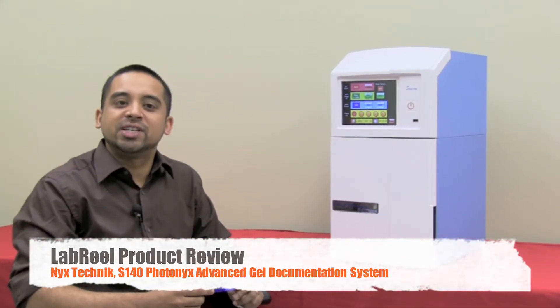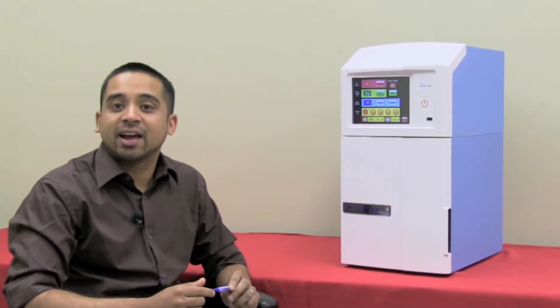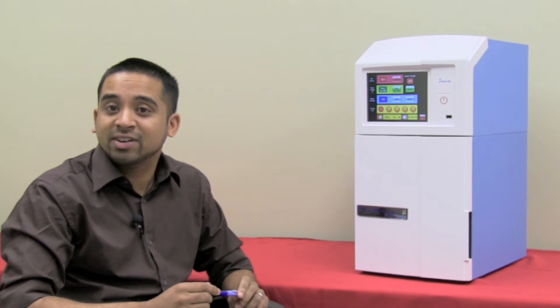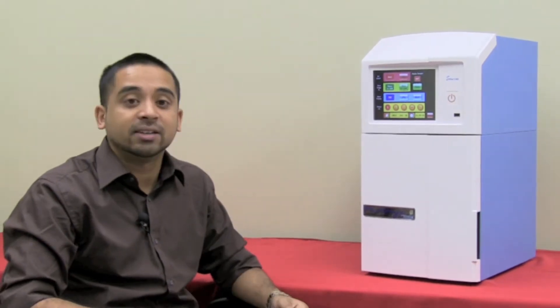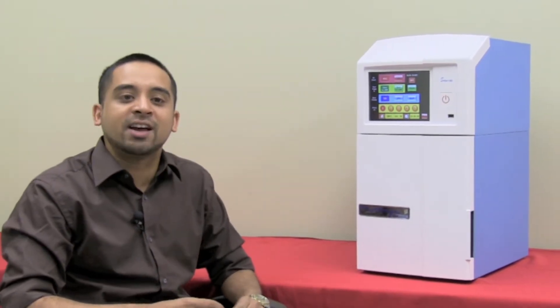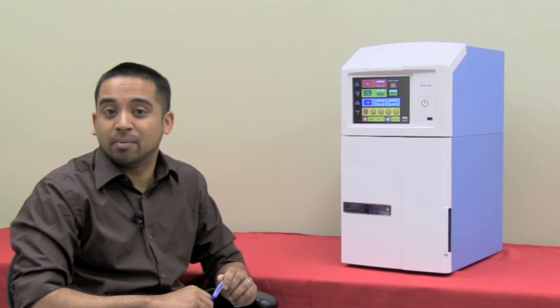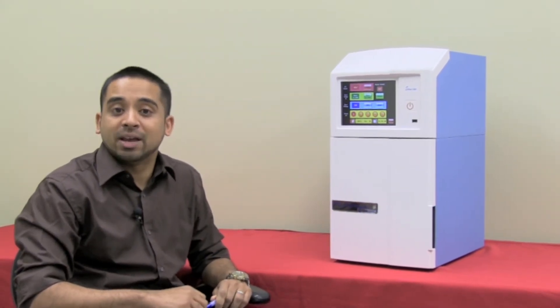The S140 is a compact gel documentation system with user-friendly features. It's easy to operate and has a very quick response. The imaging system consists of a scientific CCD camera, a motor-driven lens, and a 595 nanometer filter. There's also a UV white light transluminator. Following the design concept of a single independent benchtop workstation, the S140 does not require any external computer to operate. The built-in LCD touchscreen allows for direct manipulation of image data.